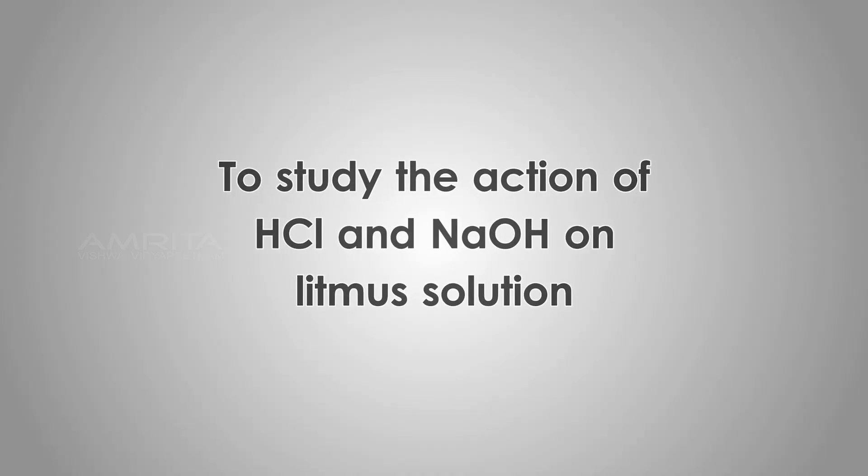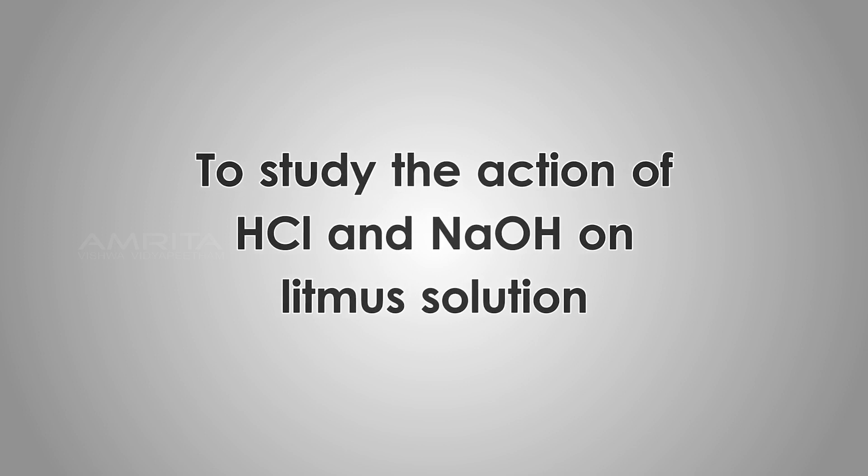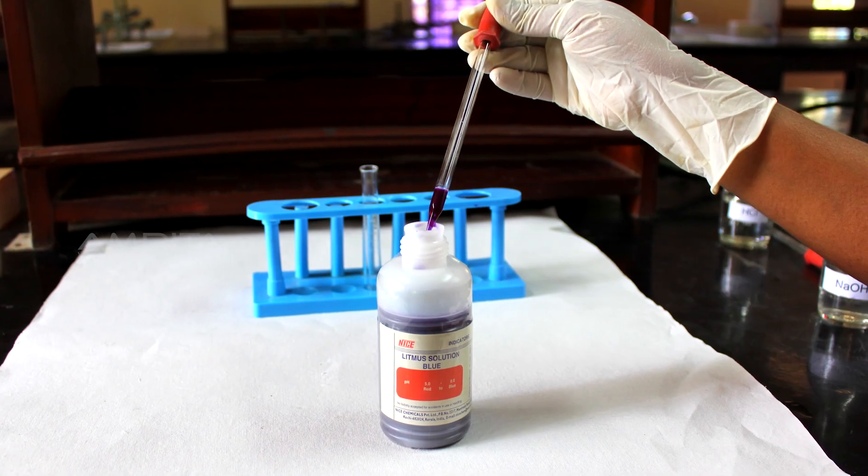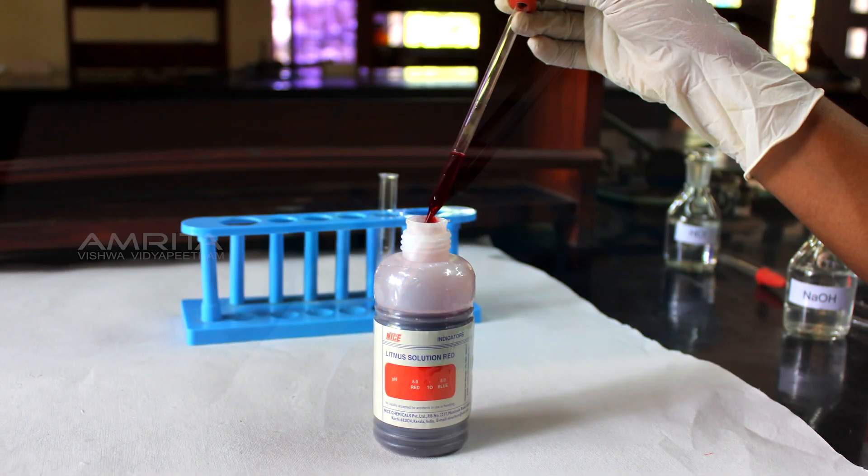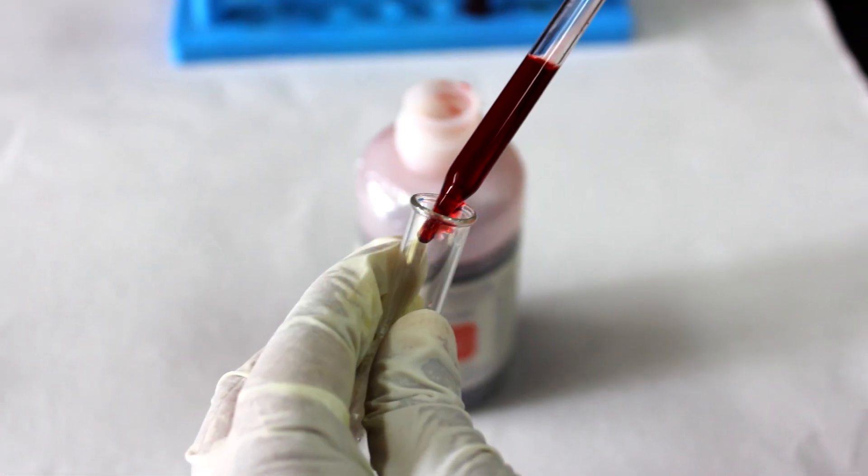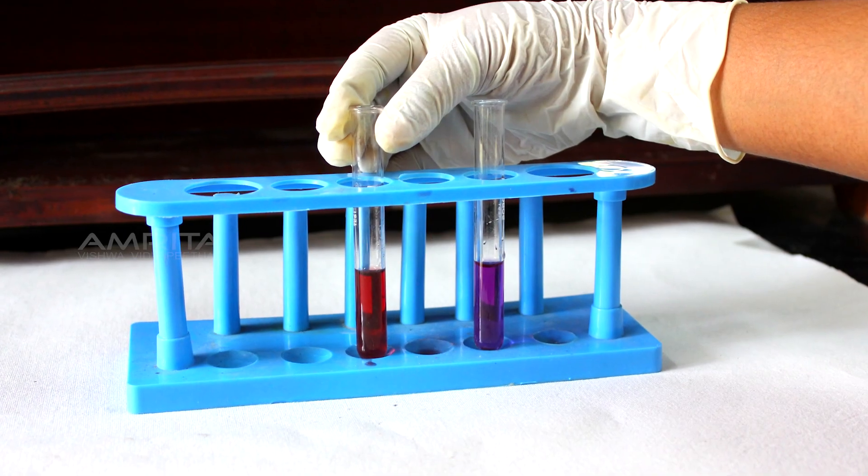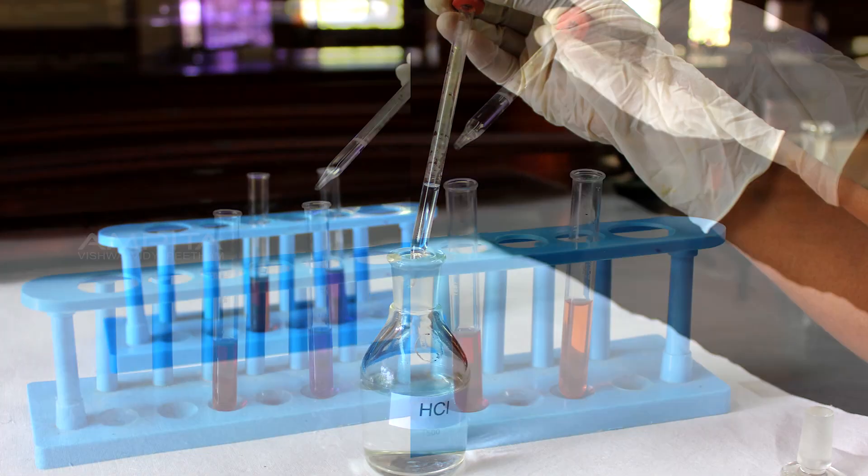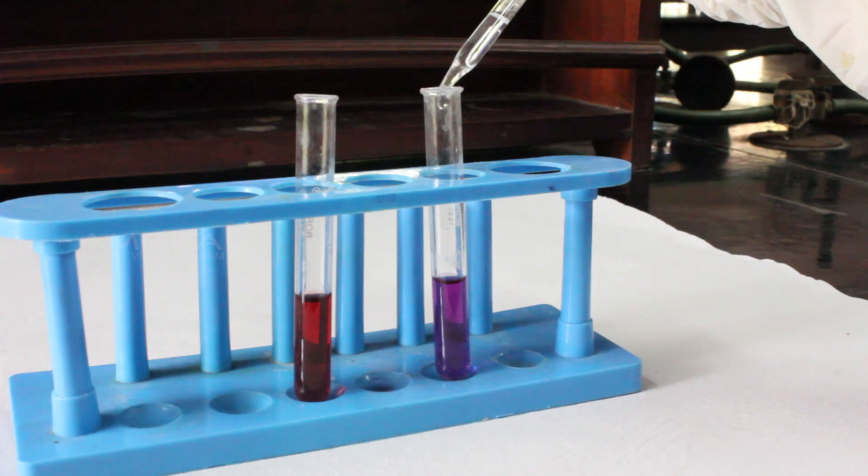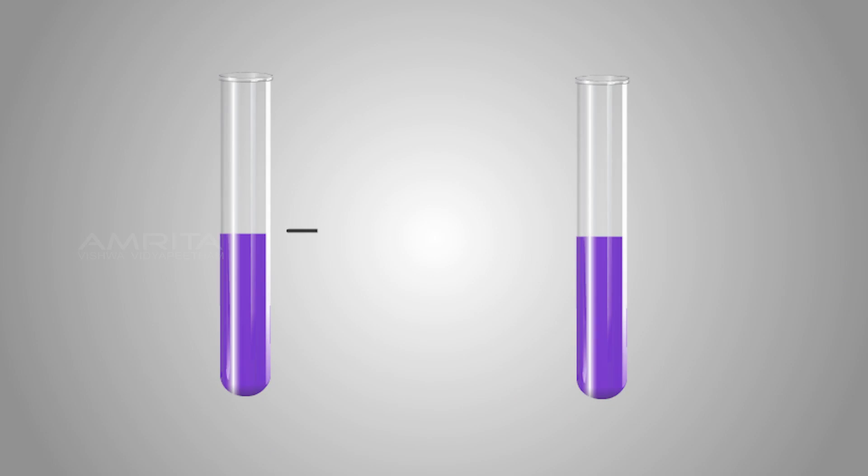To study the action of HCl and NaOH on litmus solution, add a few drops of blue litmus solution in one test tube and red litmus solution in another test tube. Place both test tubes in the test tube stand and add a few drops of HCl in each test tube. You can see that the blue litmus solution changes to red. From this, we can infer that HCl is an acid, having a pH value below 7.